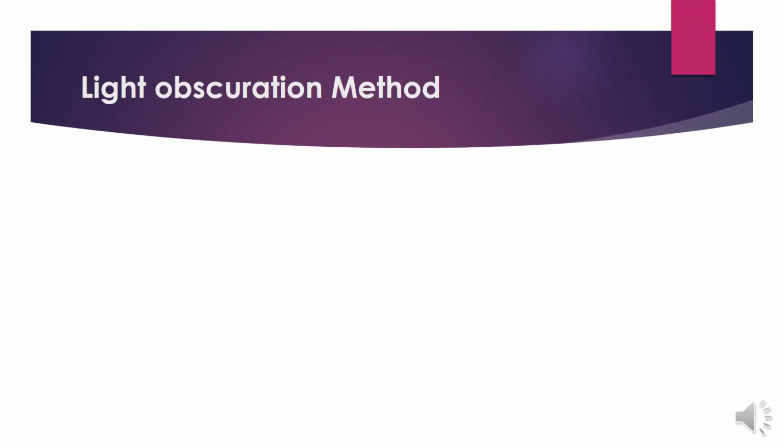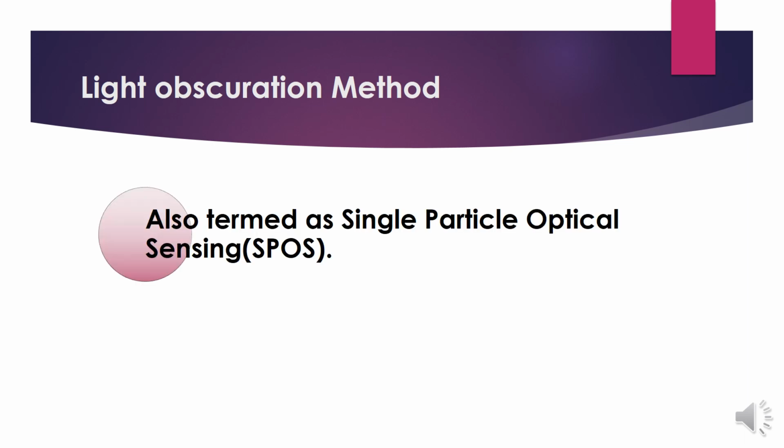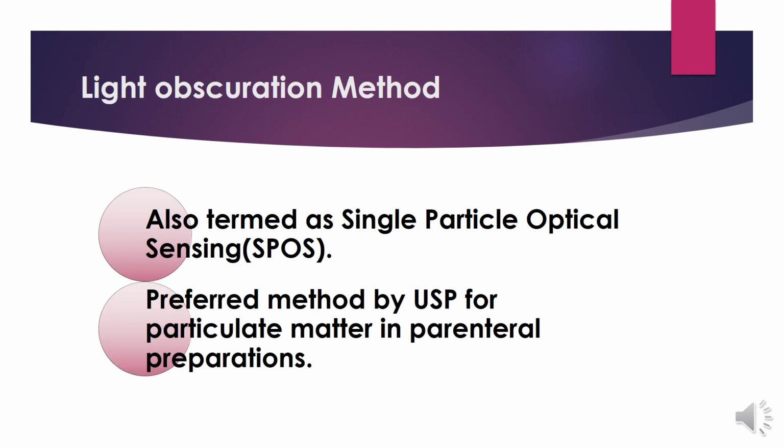The second method is the light obscuration test. It is also termed single particle optical sensing (SPOS). It is also one of the preferred methods by the United States Pharmacopoeia for particulate matter in parenteral preparations.